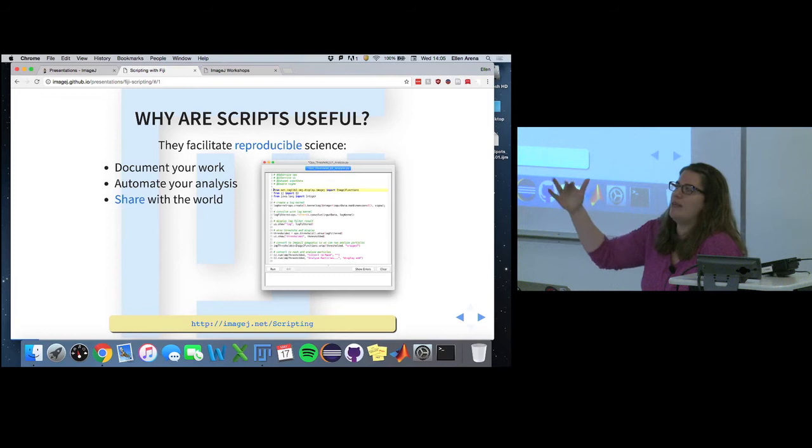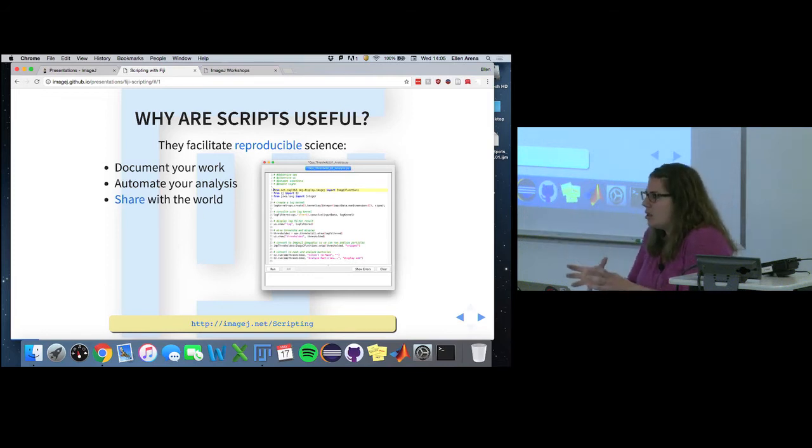So you always want to think about down the road. If I'm going to pass this code or this script onto somebody else, one of my lab mates, but also think about your lab book: in 3 months from now, can you read it again? Can you replicate it? So that's what you should be thinking about when you're writing these scripts, like commenting thoroughly and making things clear.